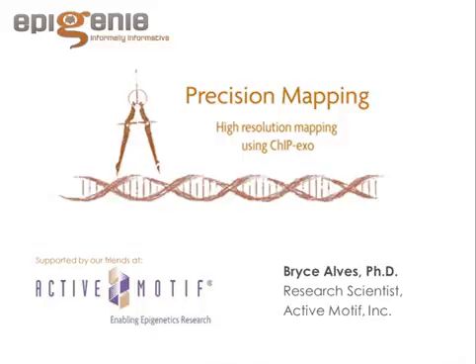But we really haven't seen a whole lot of amplification duplications of reads, the kind you would see with a high duplication from indexing primer over-amplification, since we keep our number of amplifications very low, and we keep our samples separate from each other to keep the amplifications very low. But that's more detailed in the kit.